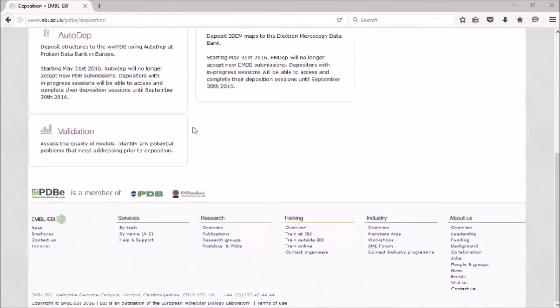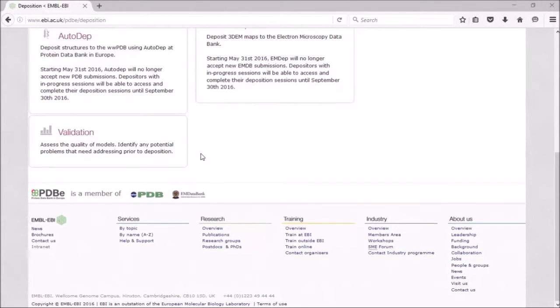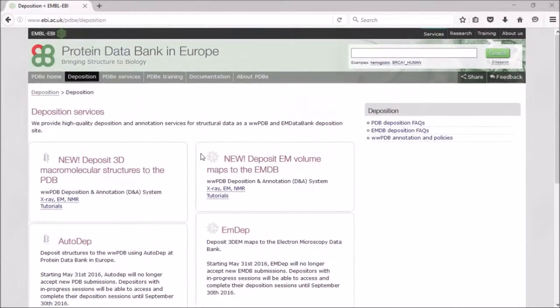Further down the page there is a link for validation, so you can use our standalone validation server to validate your structure before you deposit.